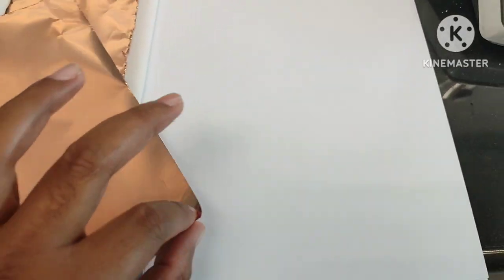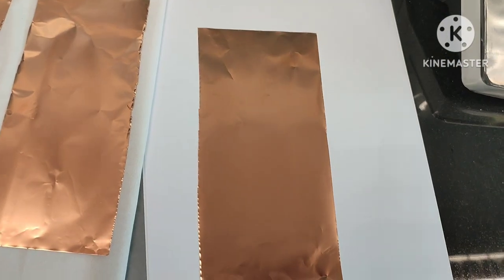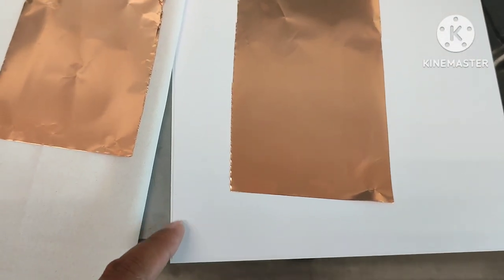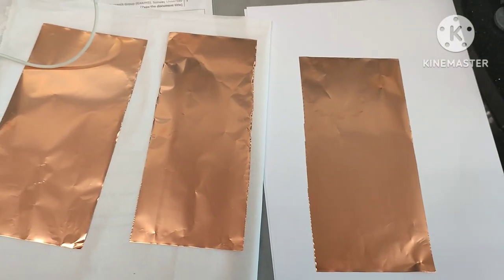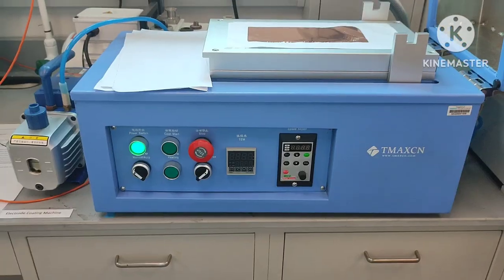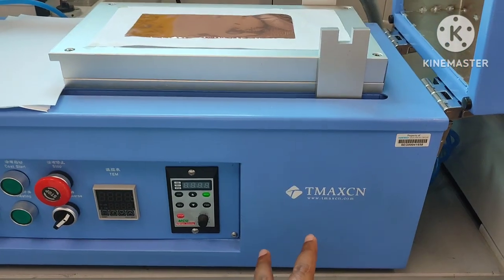First of all, you need to cut the copper foil. Our substrate is copper foil. The diameter is not so big — it depends on your coater. And then you need to prepare an A4 paper. Because I have 4 samples, I cut the copper foil into 4. One is already assembled. This is the coater machine from the TMAXCN company.